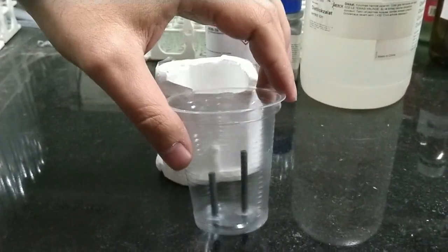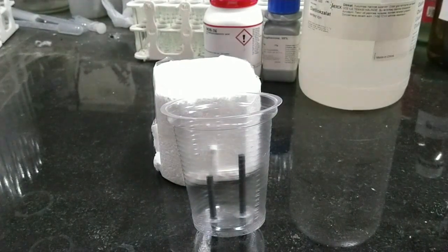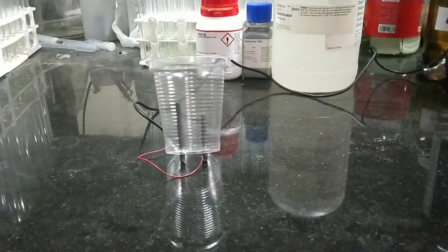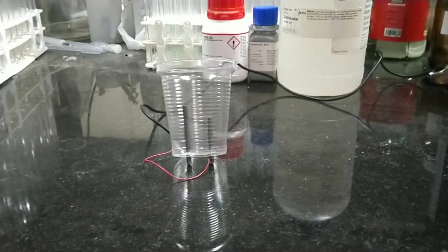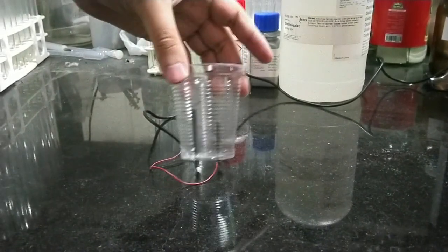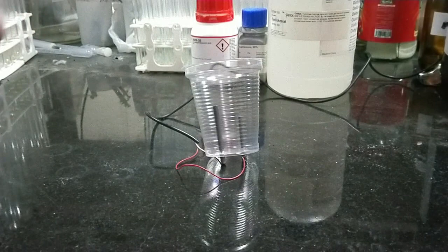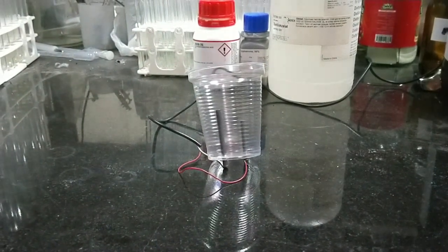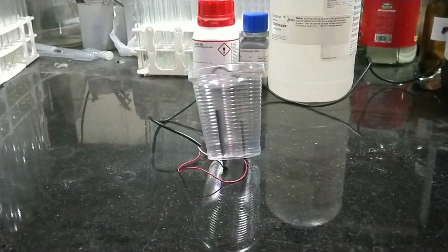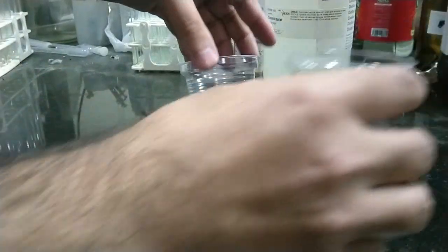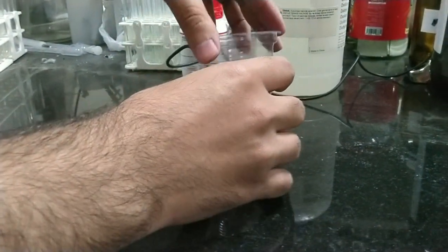So let's do the electrolysis. I attached the cables of my four volts adapter to the electrodes of my electrolytic cell. Now I add another plastic container to help it stand better.